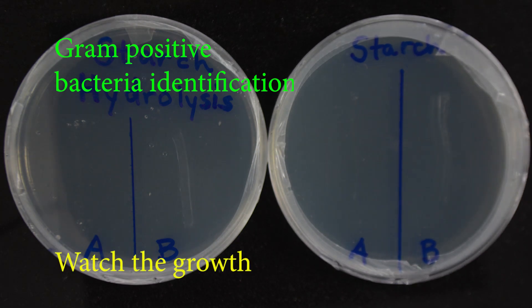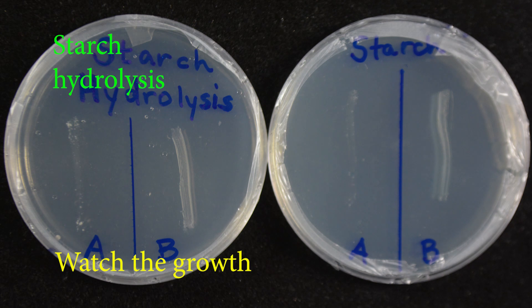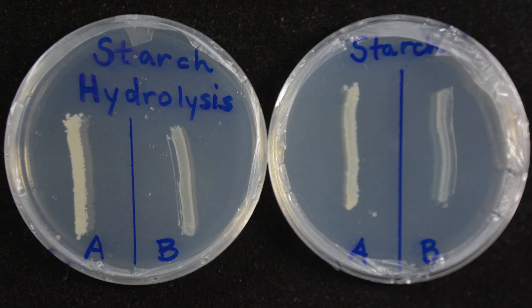Starch Hydrolysis Test Results. In order to simulate an incubator, the plates were incubated on a warming surface that allowed for a temperature of approximately 35 degrees Celsius. This time lapse allows you to observe the increase in bacterial growth for the first 12 hours. After 24 hours, it is time to read the results.